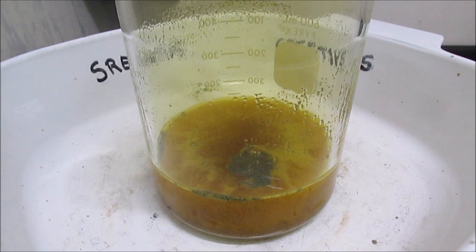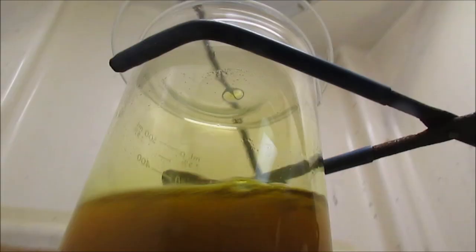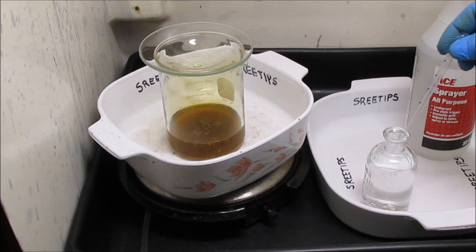And there's some solids floating on top of the solution here. If you look underneath, there's still quite a bit of material on the bottom of the beaker. So I'm going to drop another 1 mL of nitric in here and go ahead and add it to the beaker, drop by drop.